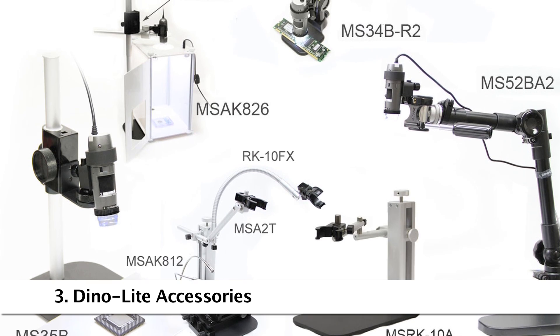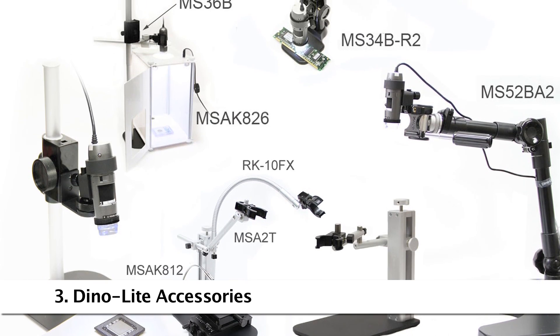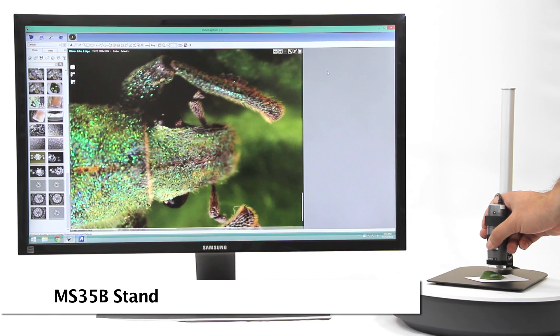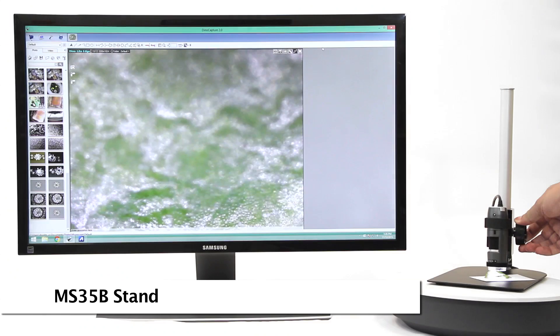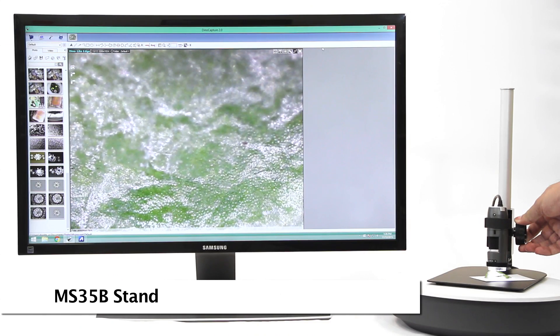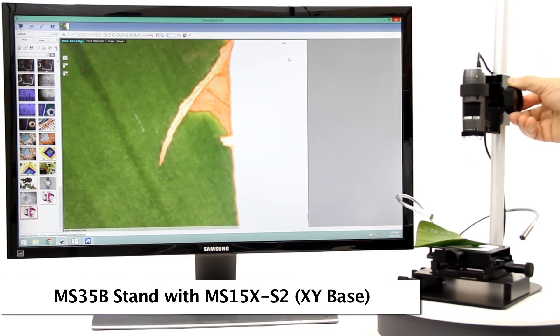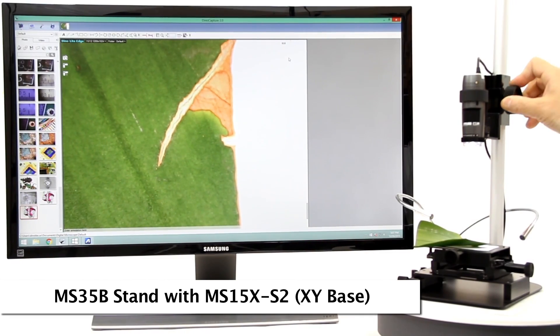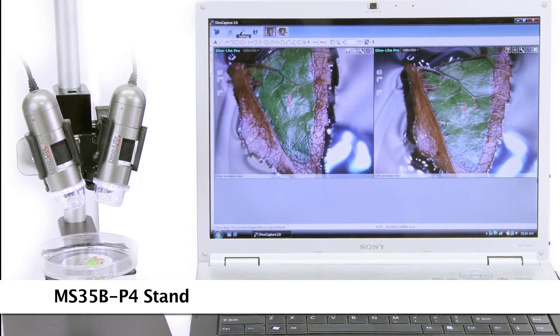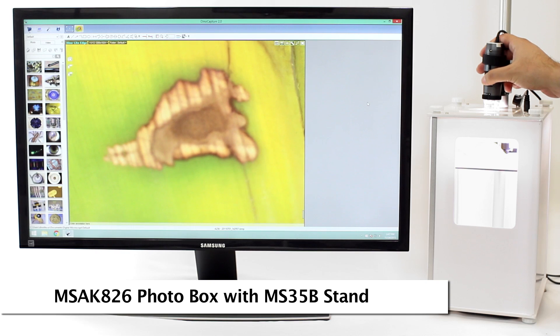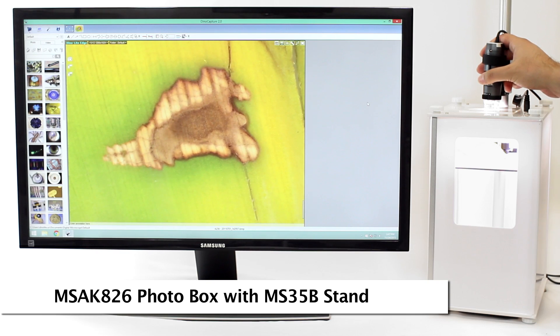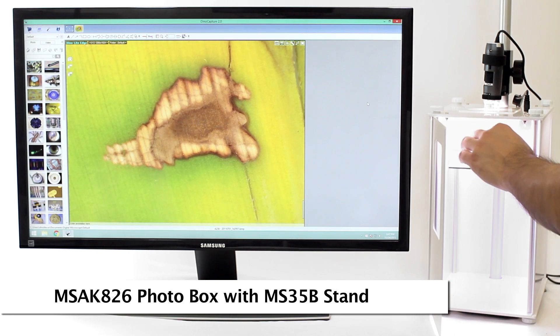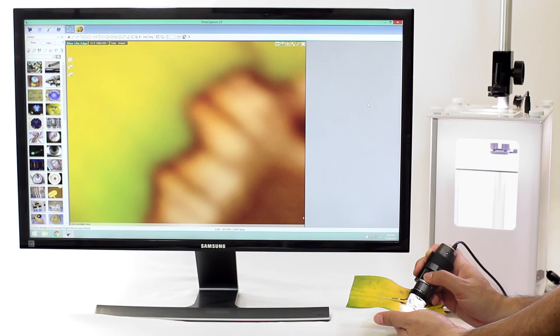Here are some compatible and recommended accessories. The MS-35B is a reliable stand with simple height adjustment and a fine adjustment knob that can be paired with the precise movement XY base. The MS-K826 photo lightbox provides a controlled lighting environment for premium imaging results.